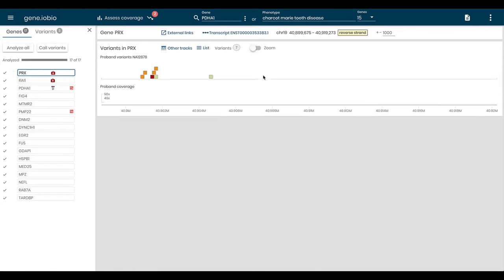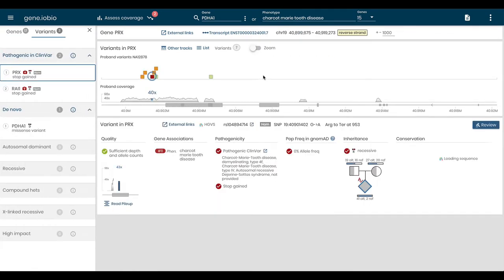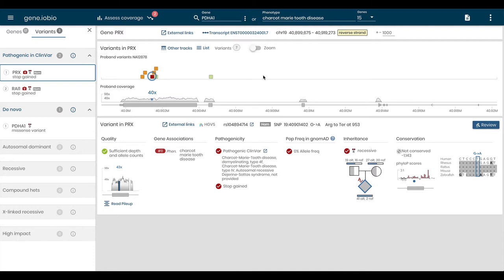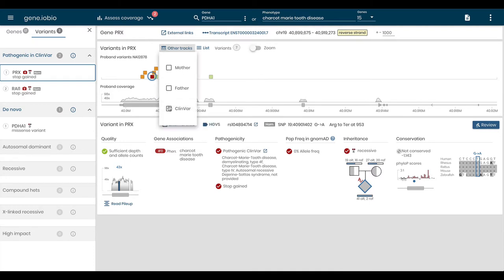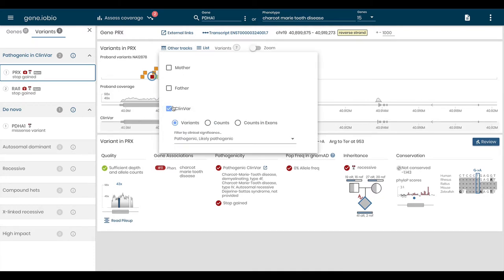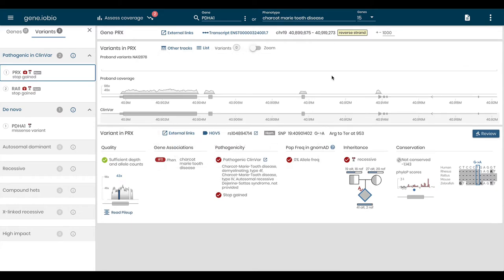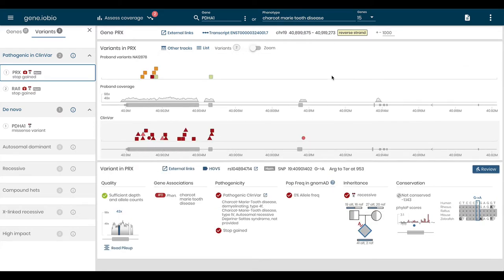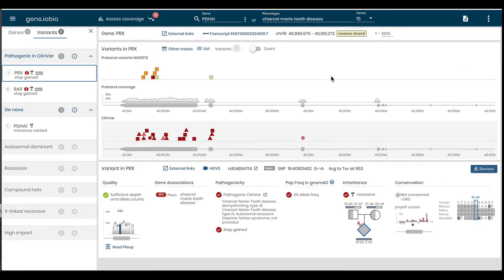You don't need to upload your files, just provide URLs, and Gene.iobio will stream relevant data for processing. Using iobio's real-time analysis platform, Gene.iobio annotates your variants with a wide range of information.